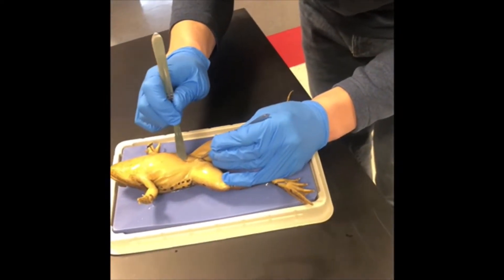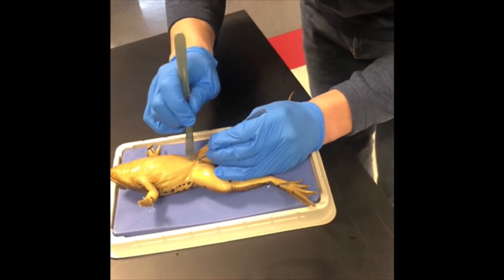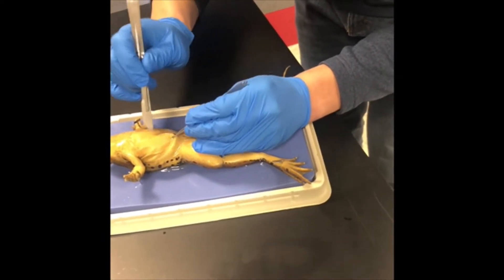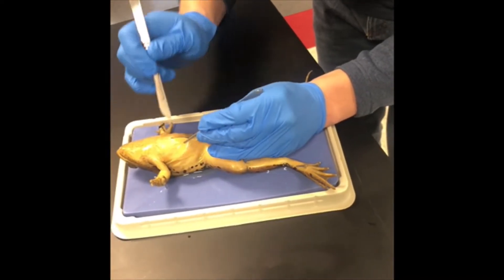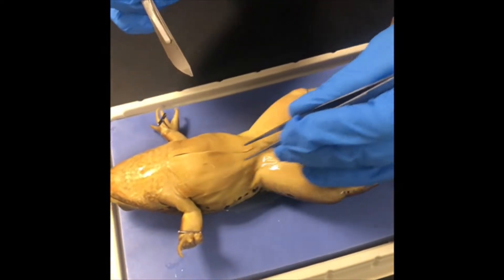You're going to begin the first skin incision. Lift the skin using the forceps at the midway point between the rear legs of the frog. Using the scalpel, make a cut along the center or midline of the frog, bisecting it equally. Notice I'm pulling up on the skin as I cut so as not to damage the muscle underneath.